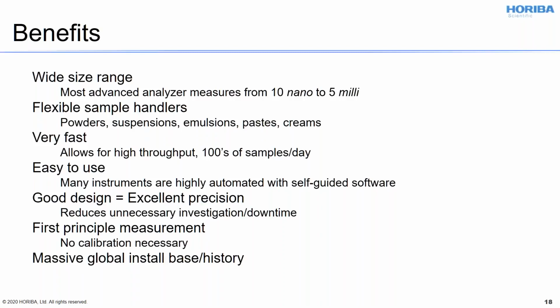It's getting frustrating when I make these presentations and realize that I spend more time talking people through a measurement than it actually takes to measure. That said, it's great when you have an analyzer, because the other thing you can do is you spend less time measuring than debating what the result should be or might be.